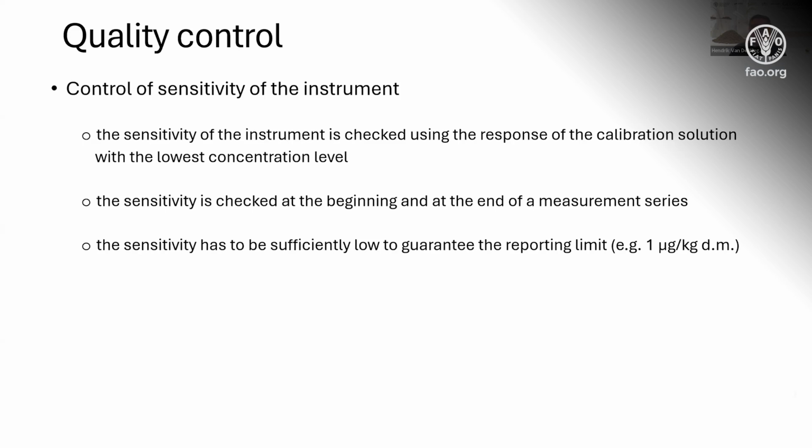Then we do interlaboratory testing inside one region or one country, like we do in Belgium. In Flanders, we have a system, Erkenningen, where once per year, all the laboratories in Belgium analyze the same sample with the same method. And there you have narrower reproducibility.